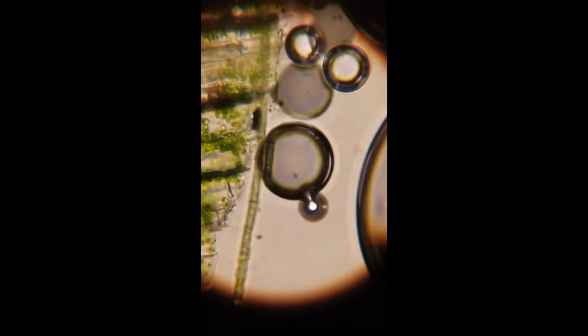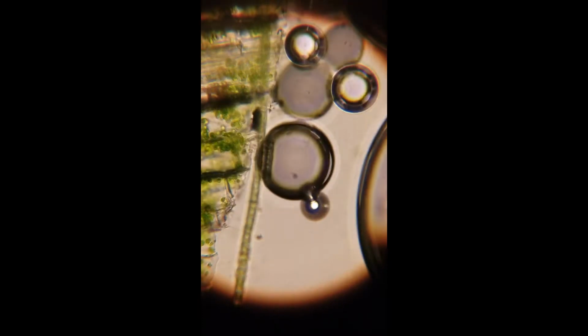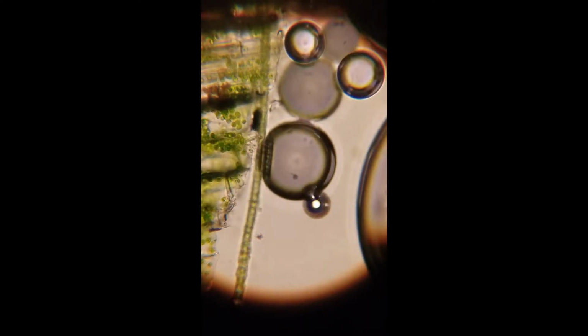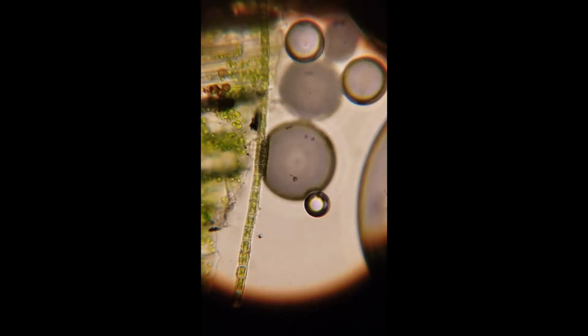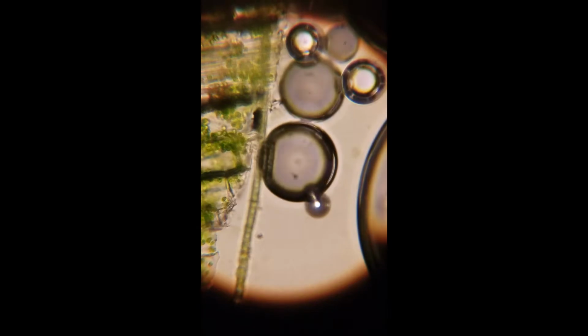Right now I'm changing the focal plane, just so that you can see the full effect through the bubble. Now I think that's really wonderful, because it's the principle of a microscope, what that bubble is doing. So basically we have a microscope under the microscope.